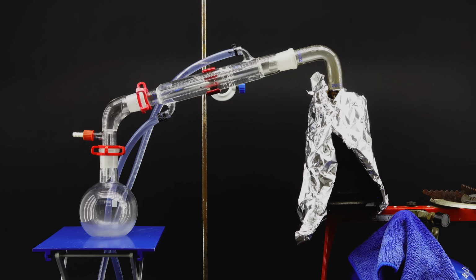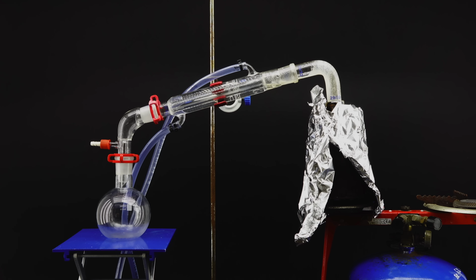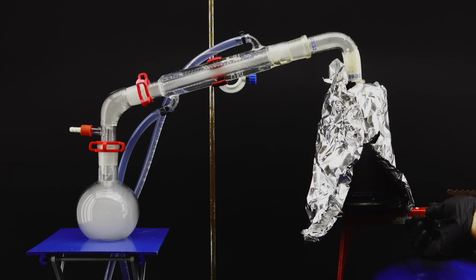Overall, when done in a metal vessel, this reaction should be pretty tame, however, just as I was about to leave for a snack again, this happened. Out of nowhere, a ton of this white foam started making its way up the can, and before I cut the heat, some of it nearly escaped to the condenser. This was quite weird since the glycol didn't seem to foam before at all, and now every time I tried to restart the stove, the foam appeared again.